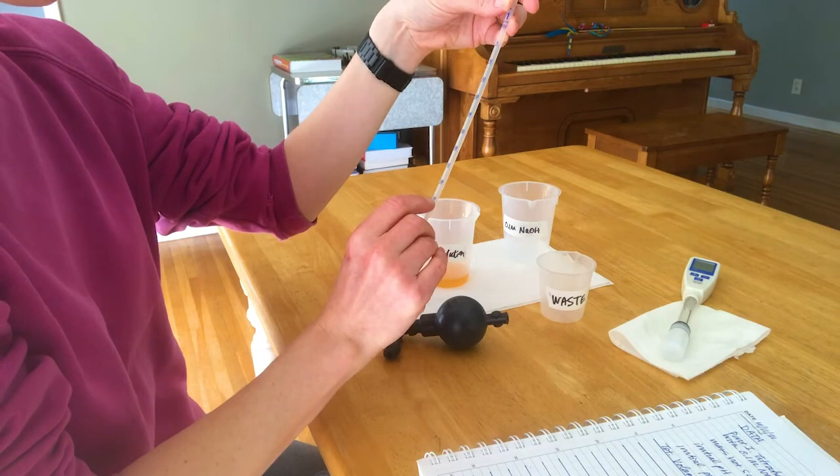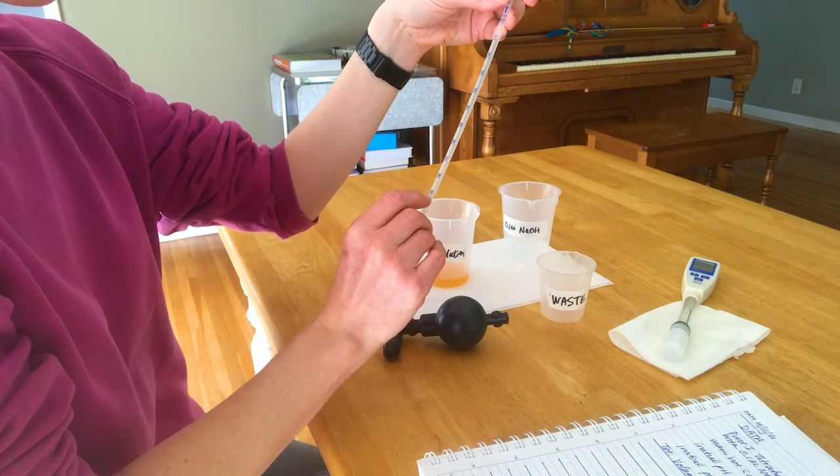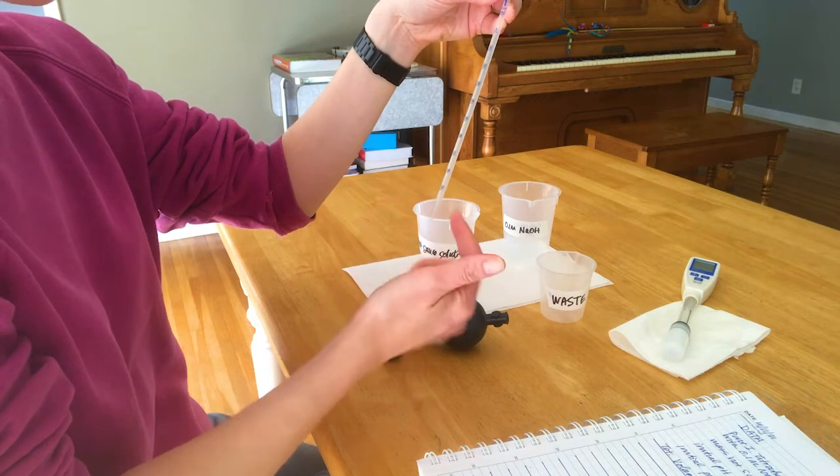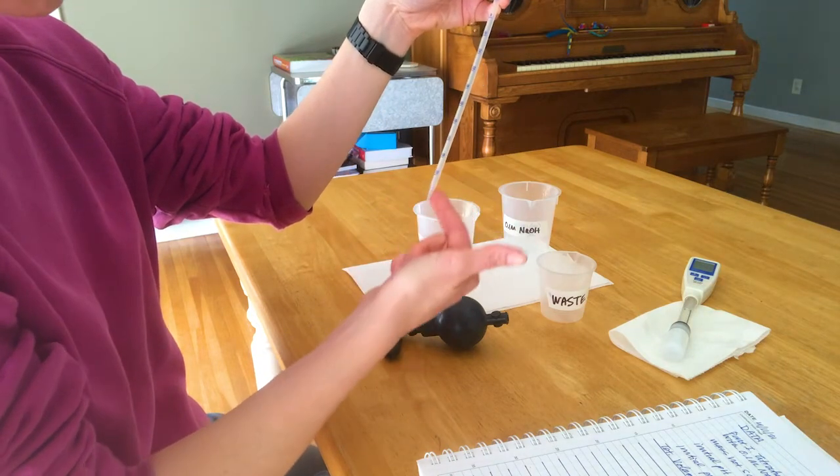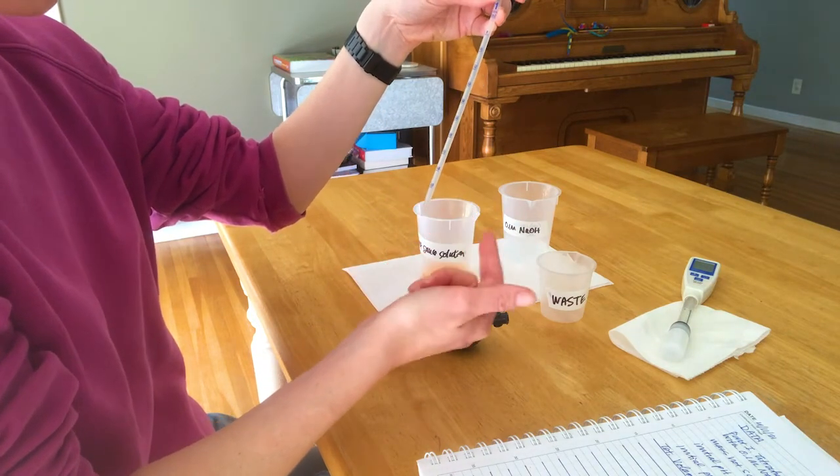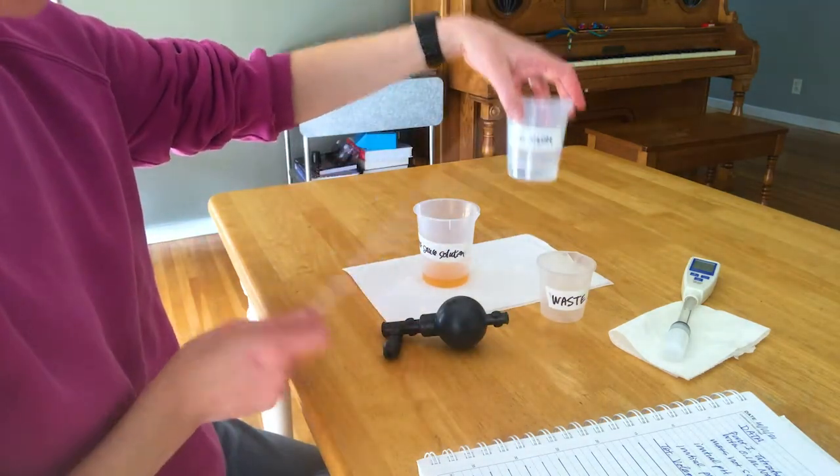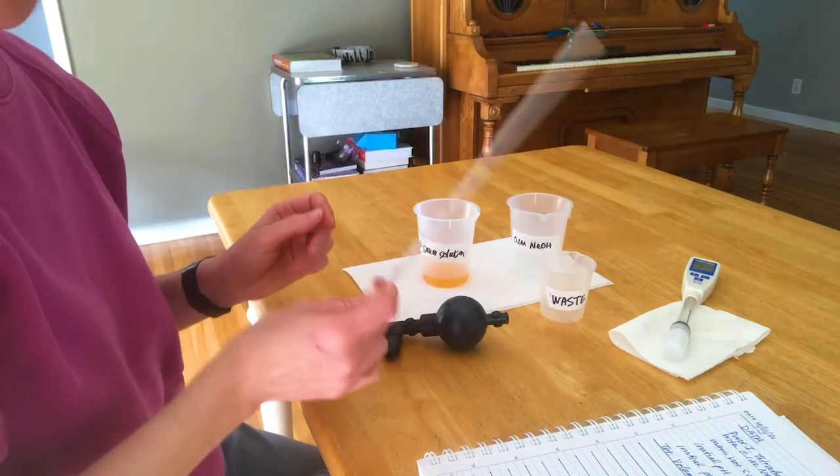Most graduated pipettes, the bottom mark would be the final volume, for example, 1 milliliter. So you would only want to dispense to that mark and not let it drain all the way. However, this one, the last mark is 0.9 milliliters. So you would want to drain it all the way if you wanted to add 1 milliliter of sodium hydroxide to the hot sauce solution.